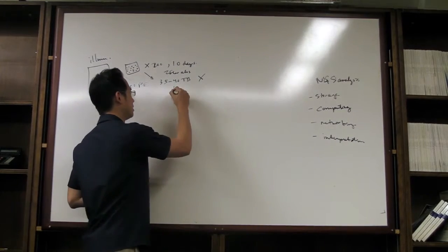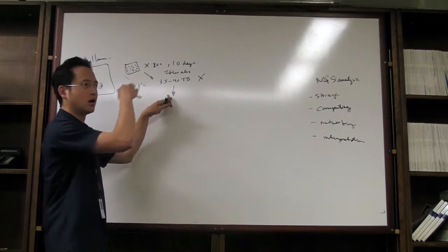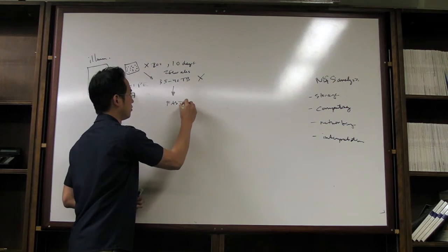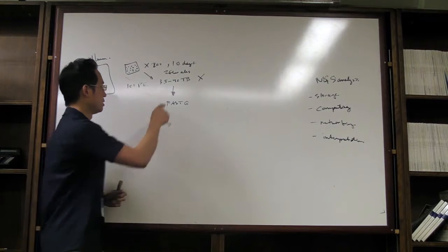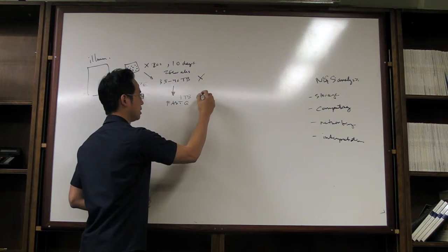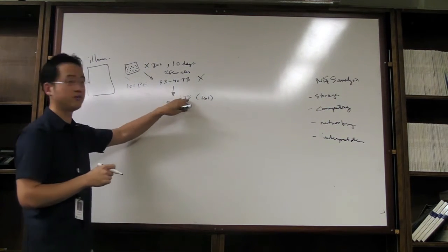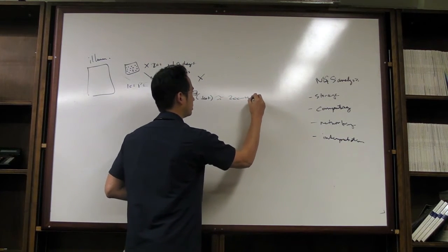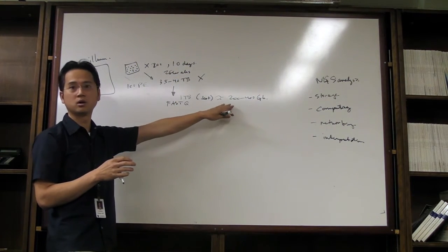You take this data, and going back to the glucometer kind of analogy, you have to go through another step that will take the image file and push it into FastQ format. And this goes from 35 to 40 terabytes to about 1 terabyte. And this is just basically a text file: your A's, T's, C's, and G's, etc. So it's still a lot of data, right? It's a huge amount of data. This is equivalent to 200 to 400 gigabases of information. And that's how you're going to fit those 50 patients and more onto this run.